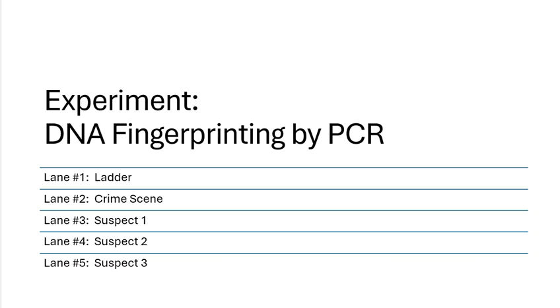And unlike the previous one with Who's My Father, these were not just simply dyes just to get you into the habit of what electrophoresis is all about. These were actually DNA bands. That's what these were. So it's going to be more true to what we would see in a real environment. Here were the samples that we injected. So number 1 is the ladder.